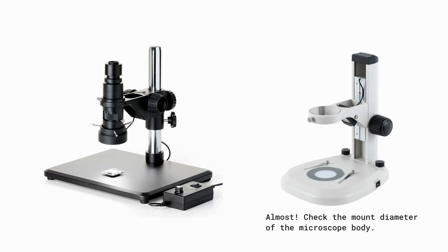Once again, simple design, glass optics and 1x C-mount adapter, that's what you need. You can use a stand and illumination from stereo microscope, they are identical.